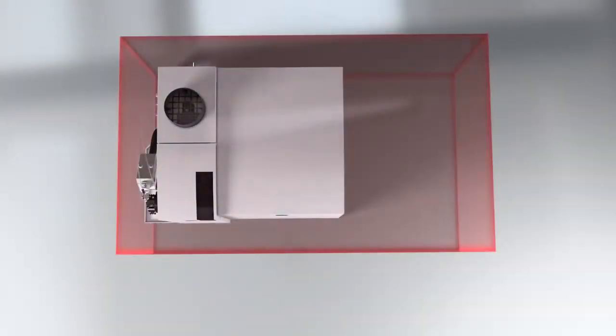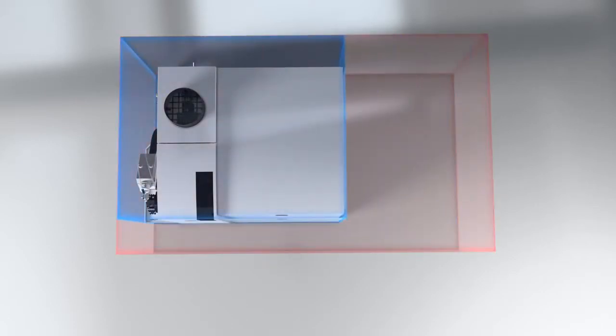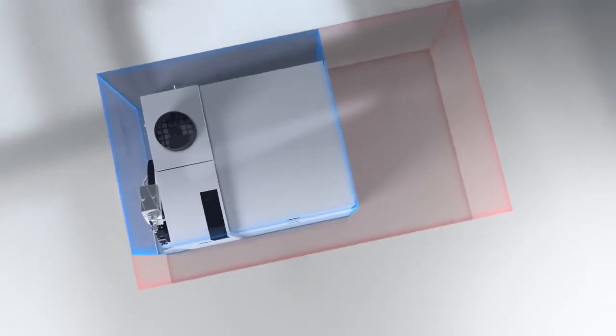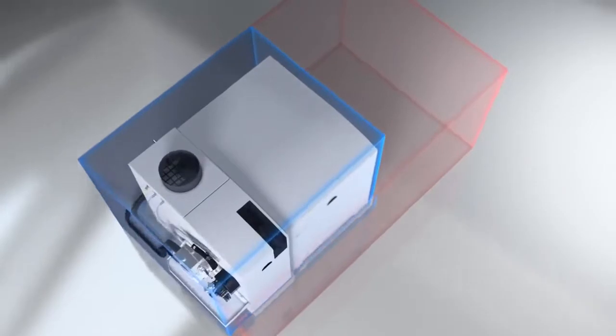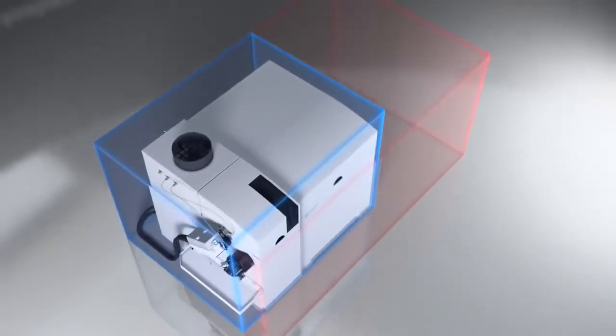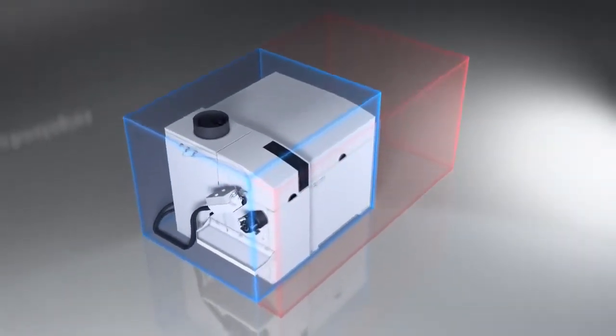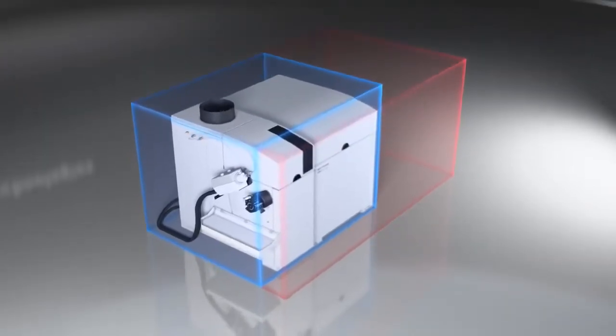The 7700 is a compact benchtop instrument, around 30% smaller than its nearest rival, and less than half the weight of some comparable systems. A compact design reduces demands on expensive laboratory space, making the 7700 especially cost-effective in clean room installations.